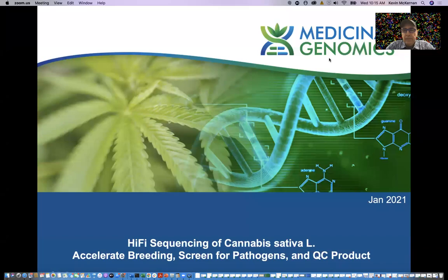Good morning, everyone. We're going to speak today about cannabis genetics and what long read sequencing has done for us, particularly these highly accurate HiFi sequencing reads. We are looking at Cannabis sativa L, which is a very repeat-rich genome. It's been very difficult to sequence with other tools outside of HiFi, and we've tried them all.